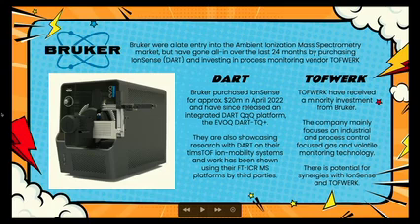Bruker have also done some investments in TOF-Works, which is an online process monitoring system, and does a little bit of work on sort of gas and volatile monitoring. But primarily their interest is in DART, and they've also demonstrated DART on everything from the EVOQ up through to timsTOFs and things, and they're doing some interesting applications with their ion mobility systems as well.